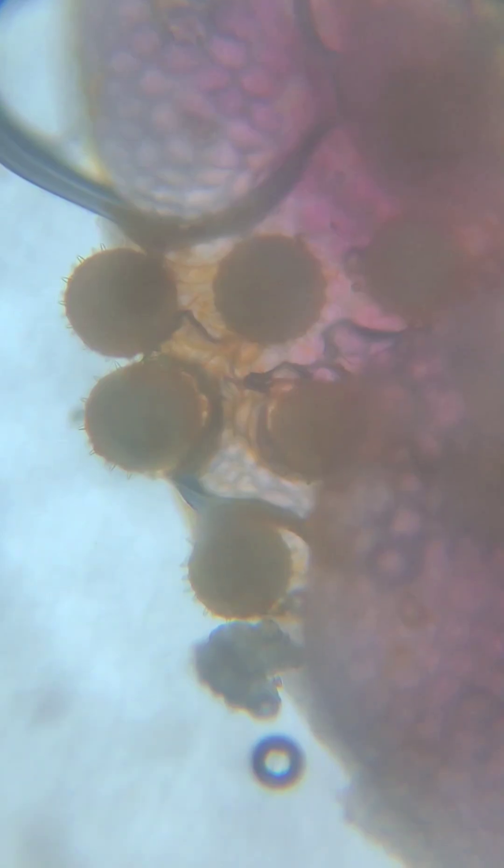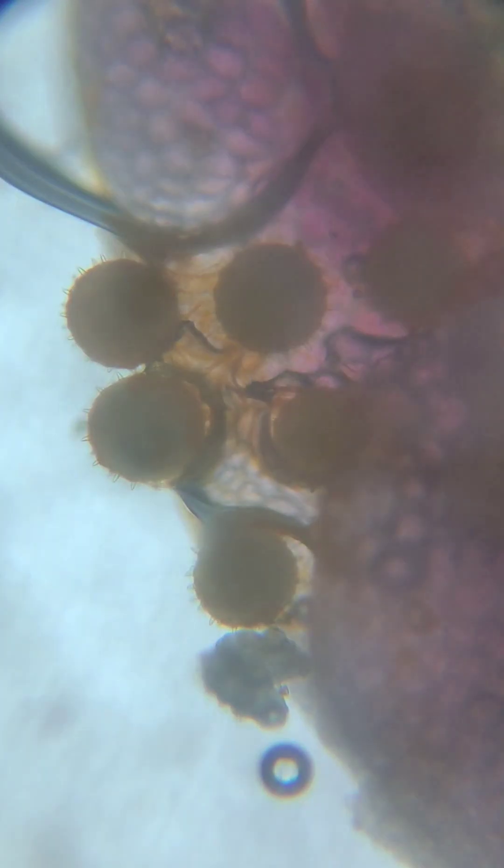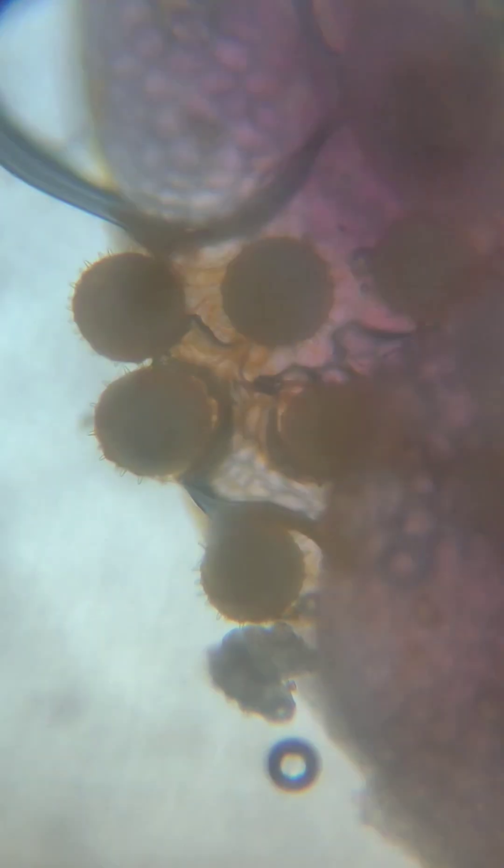See, that is the pollen grains. This is the pollen grains of hibiscus. The male reproductive part.